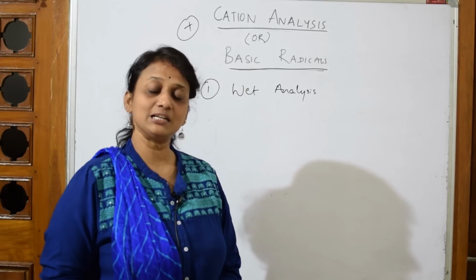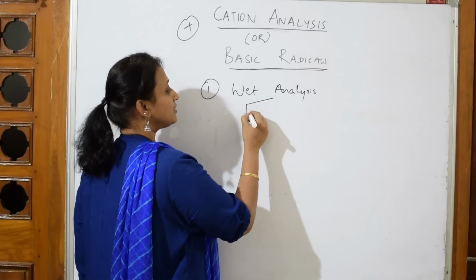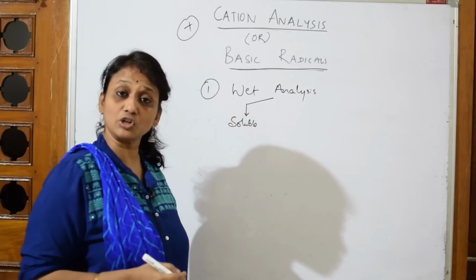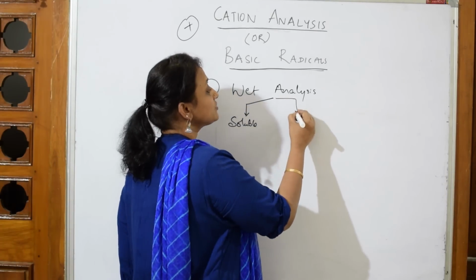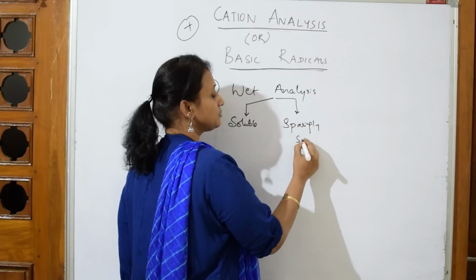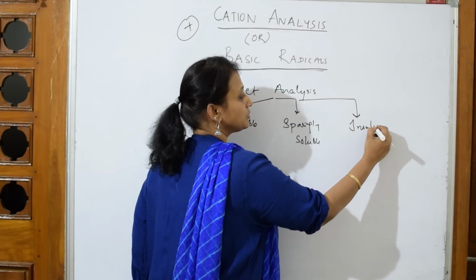In wet analysis, I'll be teaching you, as I told you, solubility. How did I divide it? I'm going to divide the salts into those which are soluble in water, the salts which are sparingly soluble, and the salts which are insoluble in water.